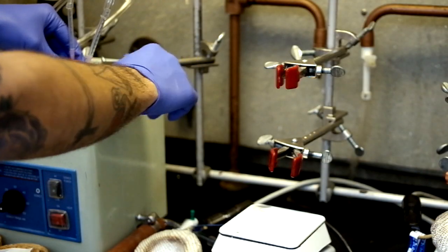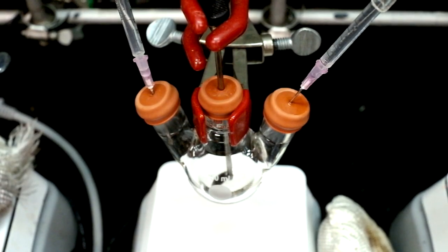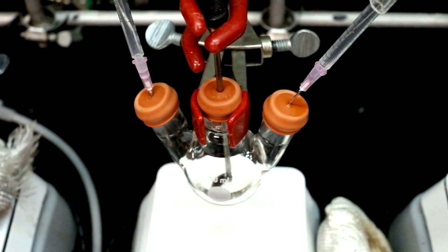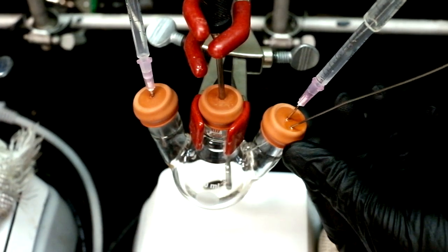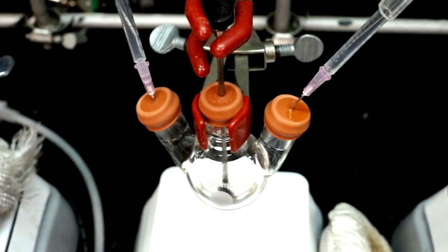Once the selenium solution has finished sonicating, it should be clear and there should be no powder left in the solution. At this point we can inject the room temperature cadmium solution into it. Set the flask aside and let the precursors mix.